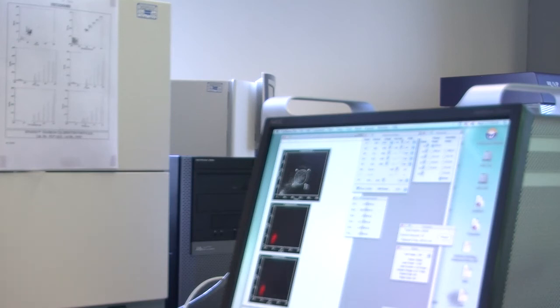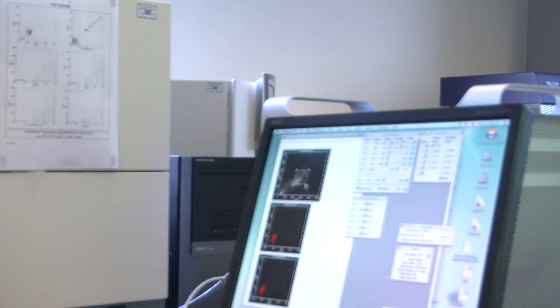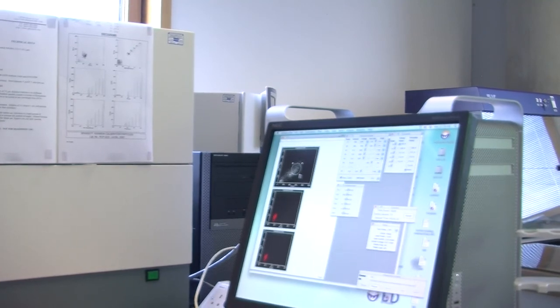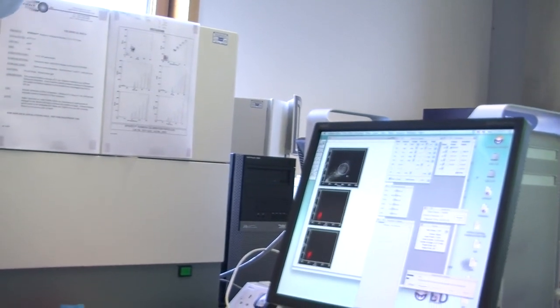So when it gets to 10,000, because that's my predetermined stop point, it will stop and save the file. Currently it's got a pause button which enables me to pause the acquisition. When it gets to the end, it'll actually stop, and that will go back to an acquire button again. You can actually specify the prefix and the suffix and so on and so forth. We're at just over 9,000 now. I'm just going to quickly double check the folder that it's putting the files in, but it should be.